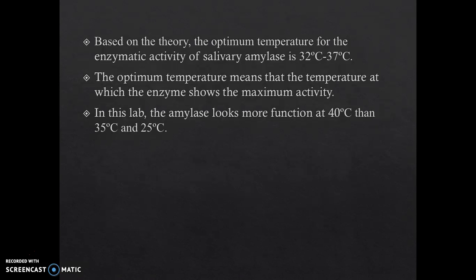In this lab, the amylase functions best at 40 degrees Celsius, then 35 degrees Celsius, and 25 degrees Celsius.